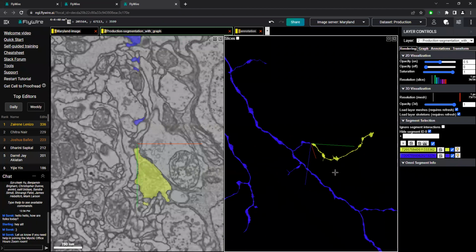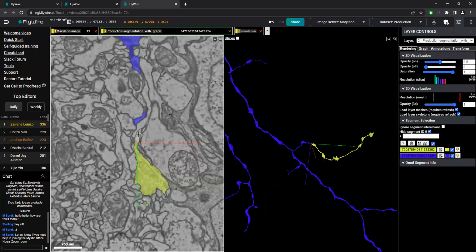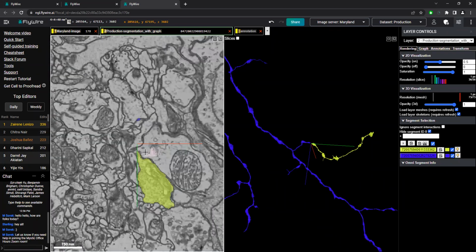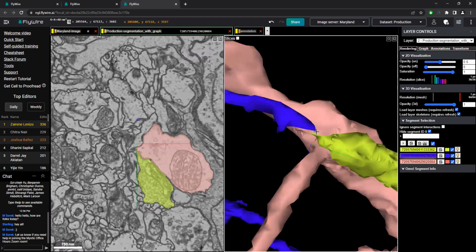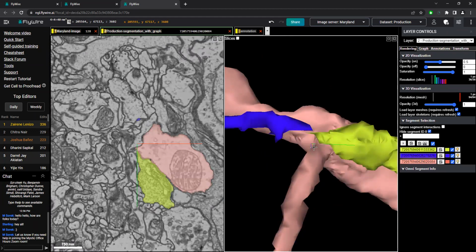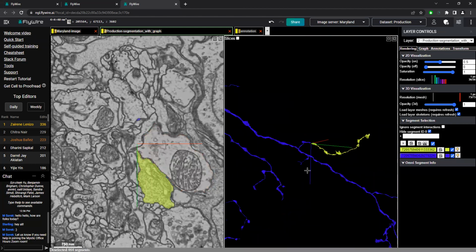And you kind of have to look too, like this area here, it looks like we have some squeezing going on with these long strands here. And that certainly seems to be the case, that something came in, this guy, our infamous red piece came in and maybe squeezed out a little bit of the strand here. So it got very thin. And then because of the black slice, it's hard to find the continuation. All right. So that's a couple of examples of how to handle tricky traces.